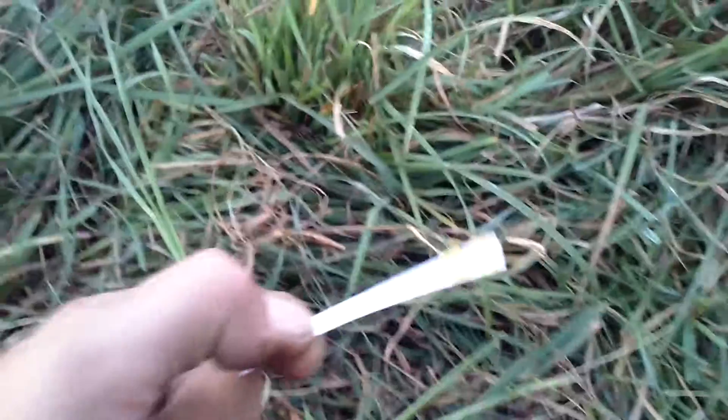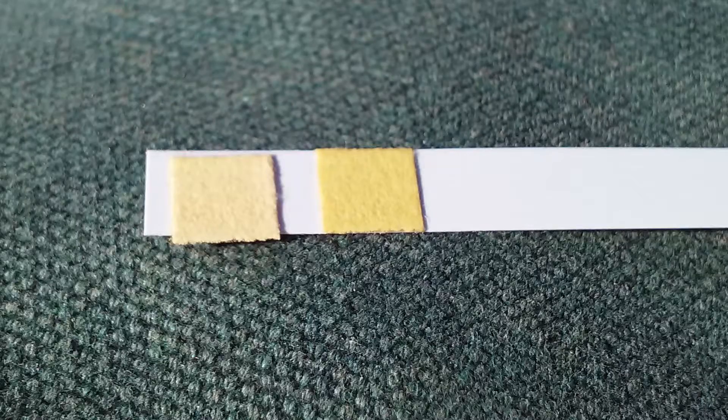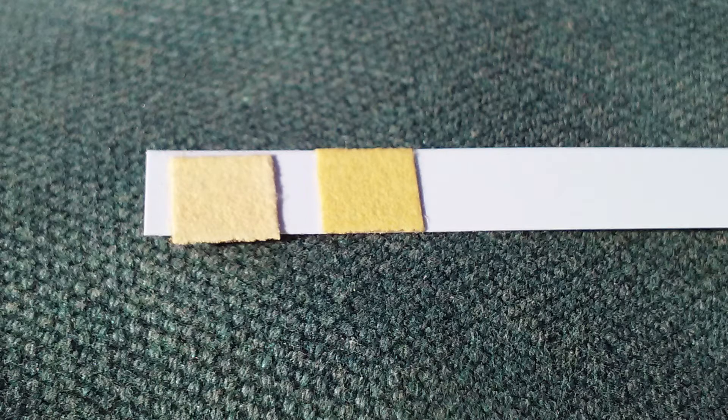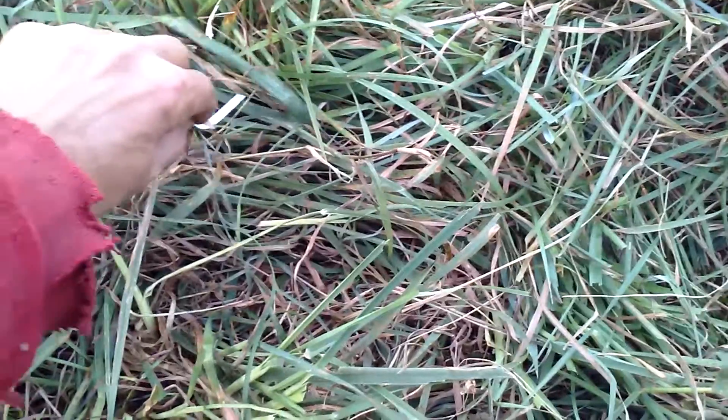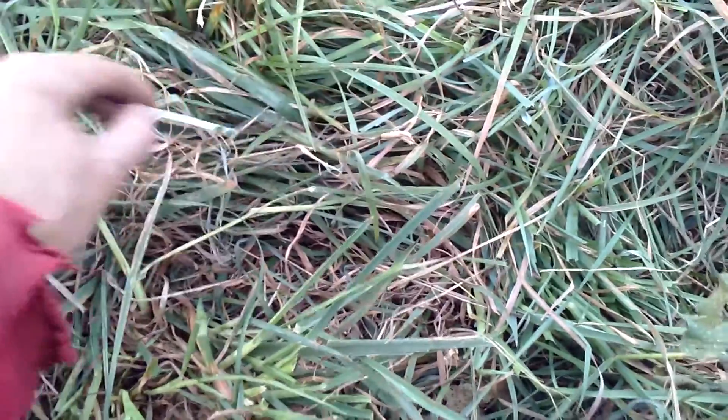Okay, so now what we gotta do — rub this pH strip. You can see there's a couple things there on the bottom. And we're just going to get the sample off of this wet grass. You don't want to get it from the soil because the soil will change the pH.